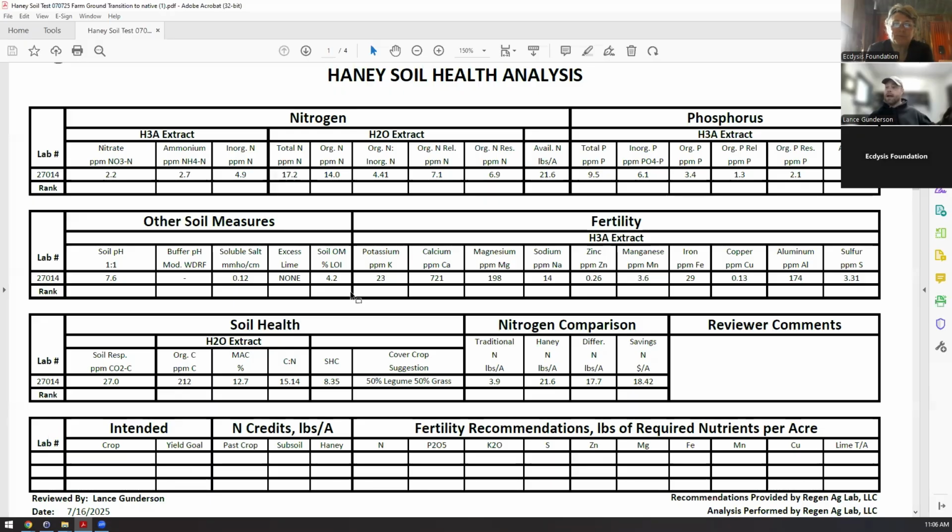Fortunately for me, I've looked at about 500,000 of these now. So I had to develop what made sense to me and say, okay, where do we start? So if you've got them in front of you or you can follow along on the screen, I'm going to walk you through where we start. Here's the irony. We are going to start with what I say is the least important number on this entire report, and that is the soil health calculation. Now, before anybody asks, why do we start with the least important number? It has more to do with that tells me where to look next.